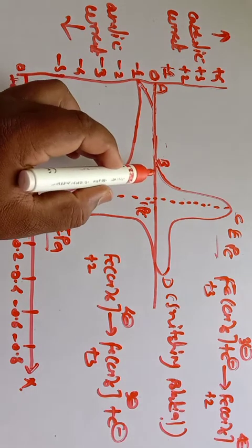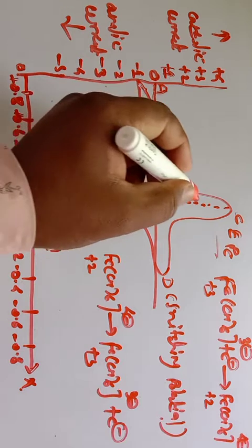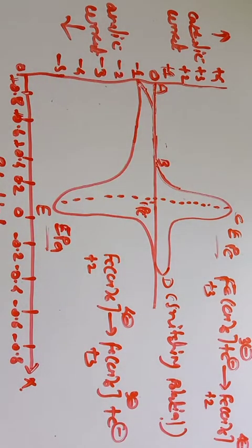So from point B, the reduction of this potassium ferricyanide starts, and it is converted into potassium ferrocyanide, that is, Fe in plus 3 is converted into plus 2. So the current which is obtained due to the reduction of ferricyanide to ferrocyanide, a rapid increase in the current occurs. From point B there is a slight reduction at the start, but a rapid increase in current is observed because we get a large peak. So we get a large current due to the reduction.